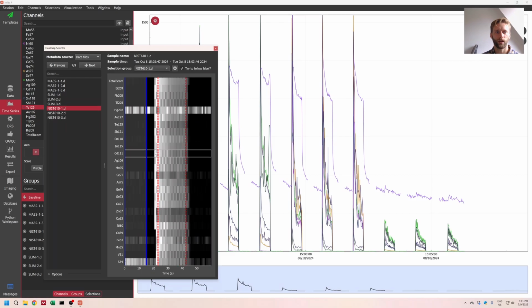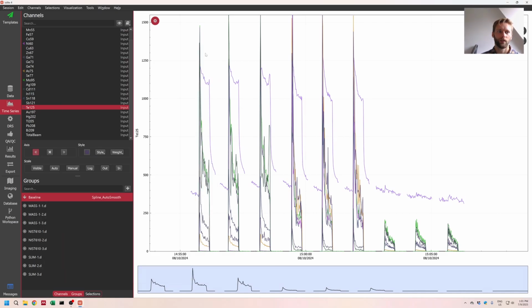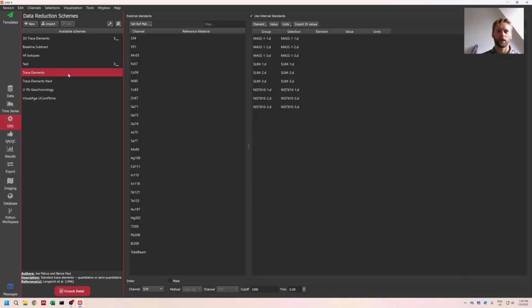So this is another thing. And this way, if you have one element that's being weird, you'll see it, which is a really nice bonus.